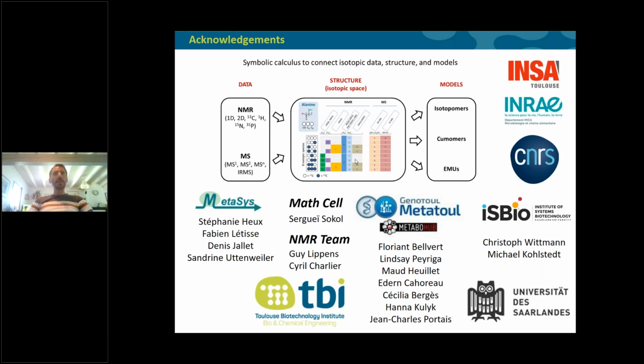It takes a couple of hours to compute for a C12 compound. I think we can go up to C15, but it will be difficult to increase above this threshold. We are currently thinking about some developments to improve the speed of the software and increase the limit further. But for now, I would say 15 carbon atoms.